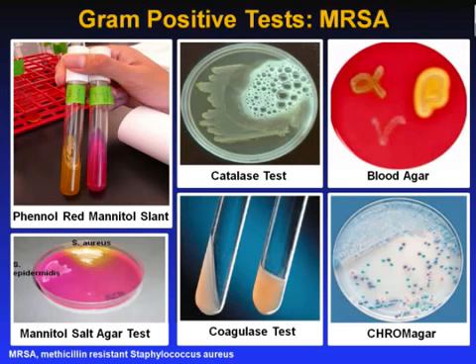Catalase is a common enzyme found in some organisms which functions to catalyze the decomposition of hydrogen peroxide to water and oxygen. The test is done by placing a drop of hydrogen peroxide on a microscope slide. Using an applicator stick, a scientist touches the colony and then smears a sample onto the hydrogen peroxide drop. If bubbles or froth forms, the organism is said to be catalase positive. Staphylococci and micrococci are catalase positive.